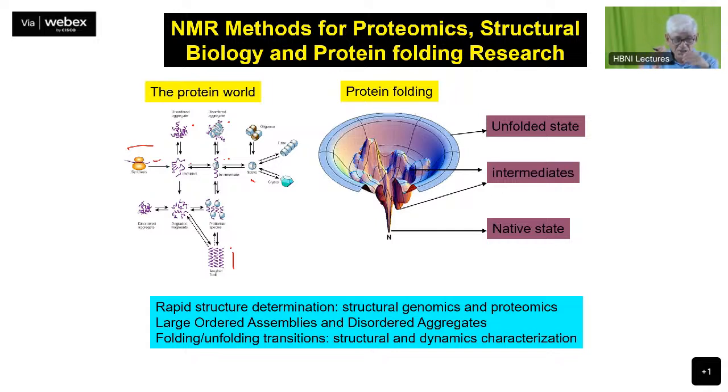Therefore, there is a continuous explosion of methods in NMR and also in other techniques, even in X-ray crystallography, a continuous explosion of techniques to do things rapidly and as fast as you can. And that is an important aspect of doing structure determination in NMR as well. The methods development happens as a consequence of this. As we go along, you will see that various kinds of situations will appear. There is one other situation which is not listed here, and that is called the IDPs.